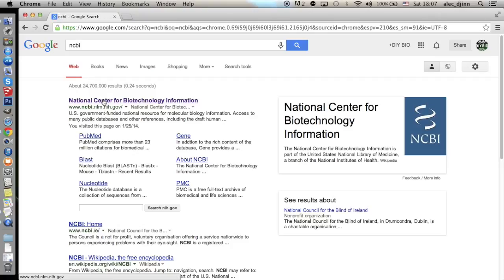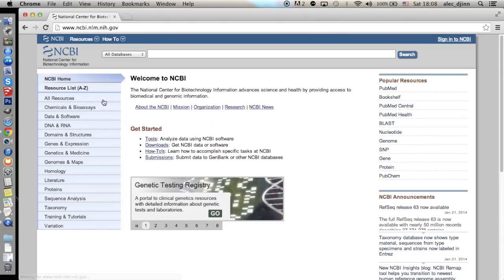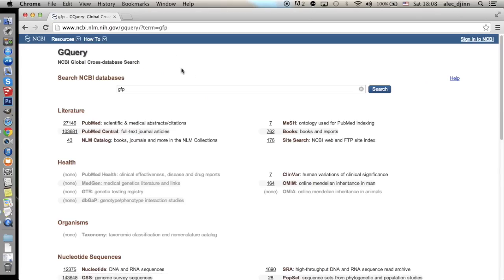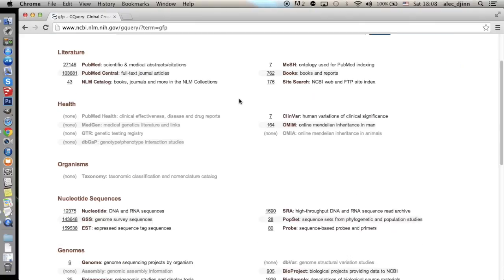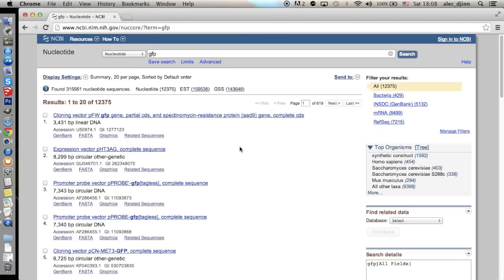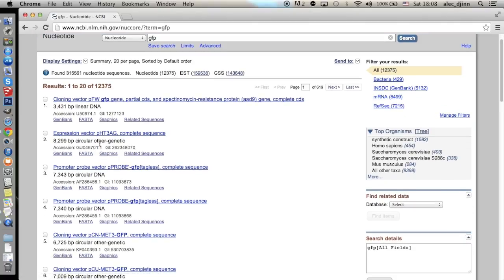We can look for it on the NCBI website — just Google NCBI and there it is. Now we search for GFP. We have to look in the search results for nucleotide sequences, where we can find thousands of vectors and constructs that contain the GFP gene. For the scope of this tutorial, it's best to choose a plasmid, so we're looking for circular DNA.